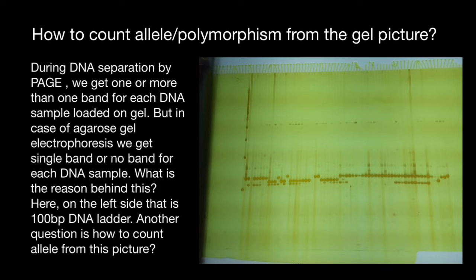In agarose gel, agarose is a polysaccharide derived from seaweed, and it is used to create the gel matrix. In agarose gel electrophoresis, agarose gels have larger pore sizes and are suitable for separating larger nucleic acids, such as genomic DNA and larger RNA molecules.